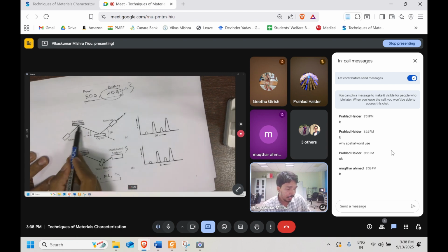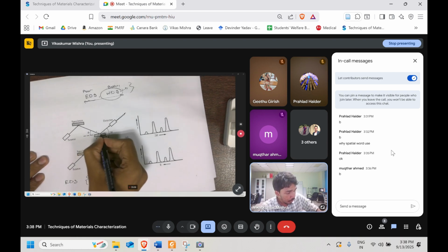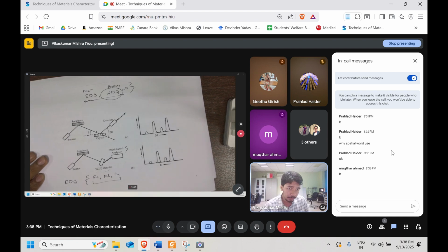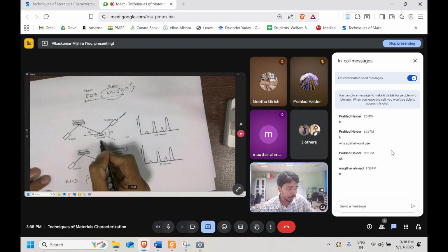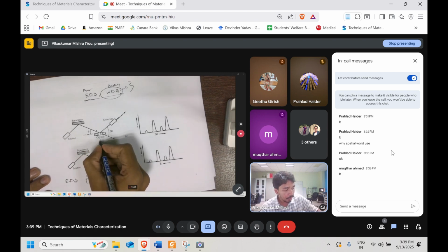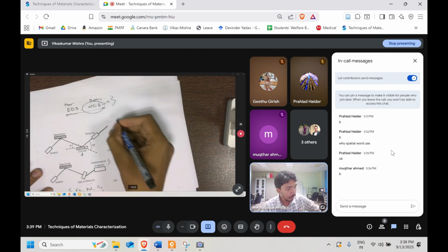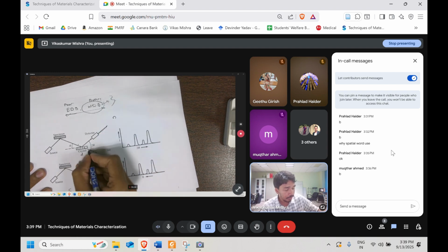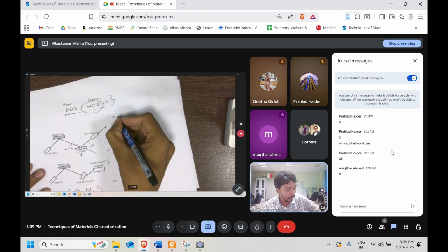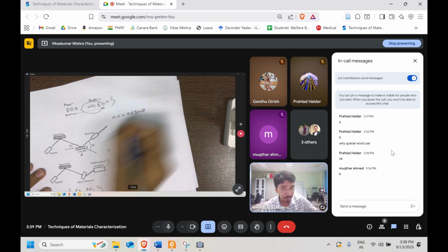The source again creates the X-ray. Now I have the crystal over here. This is the heart of the entire WDS detection. This crystal is very important. It is a single crystal, and we are already aware of the d-spacing of this particular crystal. X-ray is coming, it interacts with the crystal, and it will diffract. We know that n lambda equals 2d sin theta.